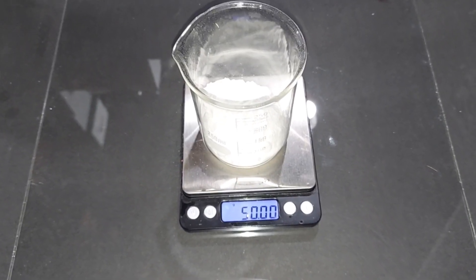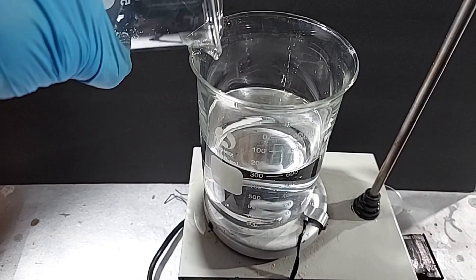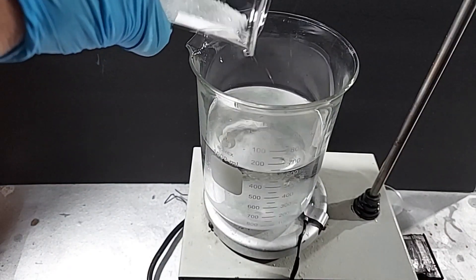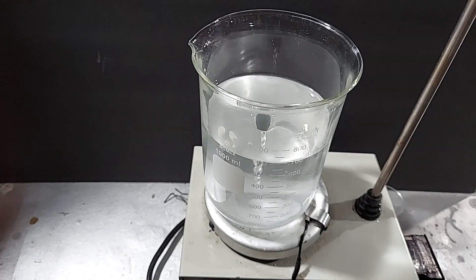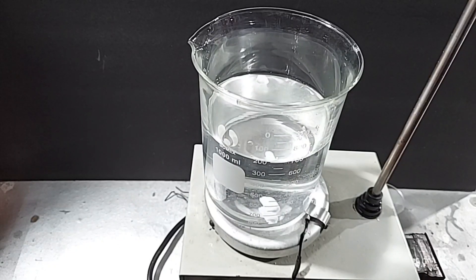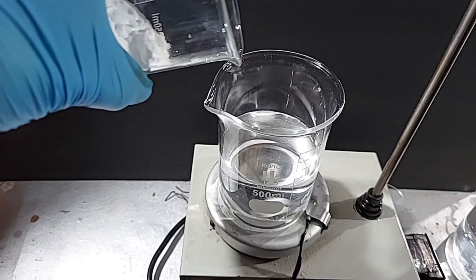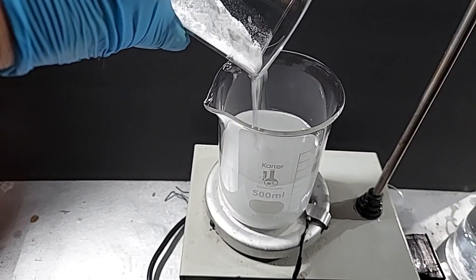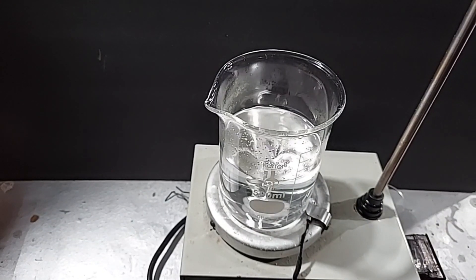So without further ado, let's make our magnesium carbonate. We have 150 grams of magnesium sulfate heptahydrate pre-weighed and 50 grams of sodium carbonate pre-weighed. I have 600 mL of distilled water — turning on the magnetic stirrer and adding the 150 grams of magnesium sulfate. The magnesium sulfate is completely dissolved. Next is the sodium carbonate: I have 300 mL of distilled water, turning on the magnetic stirrer and adding the 50 grams of sodium carbonate. The sodium carbonate is now dissolved.